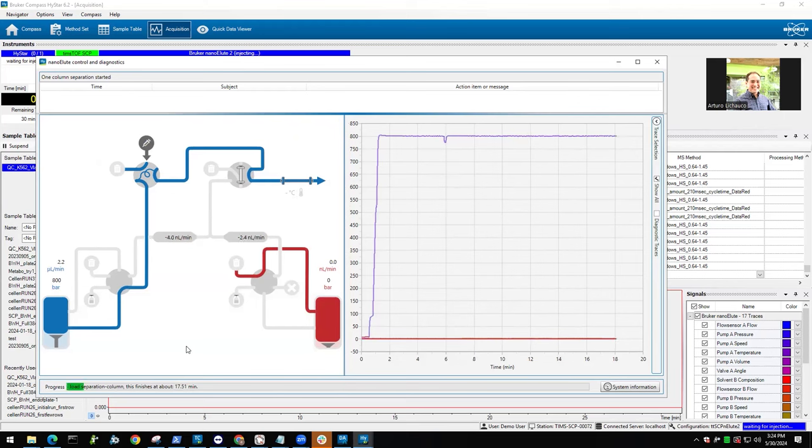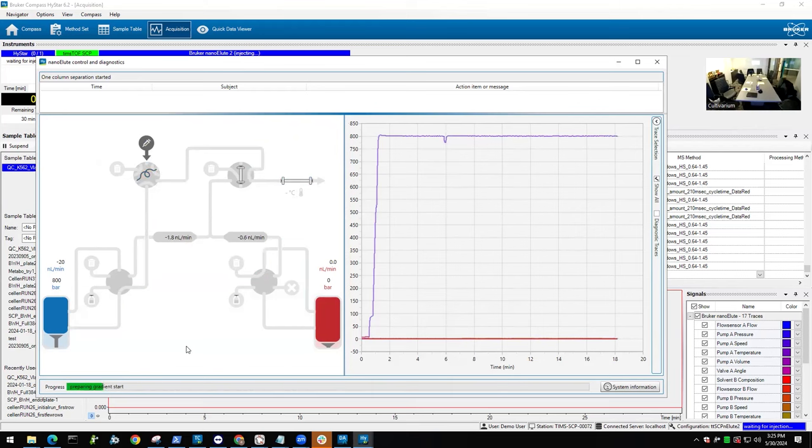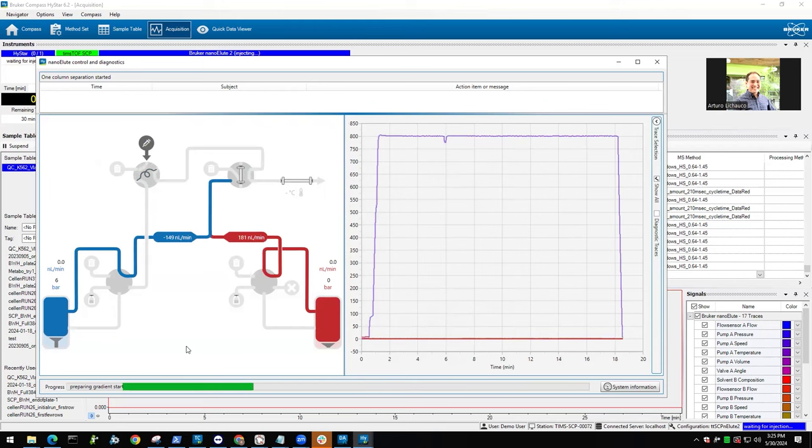And that's the disadvantage of loading directly onto the column. Having a trap in between, this process would be much, much faster. But of course, it always comes with some losses in identifications. But loading is now done, so the pressure is released. Then we prime this line here. Once this is done, the elution starts. Hopefully we see some peptides.